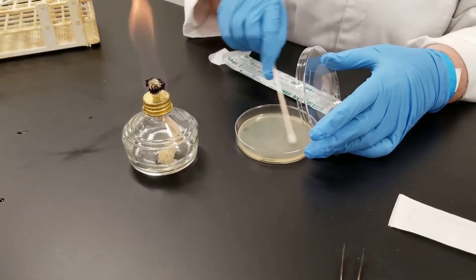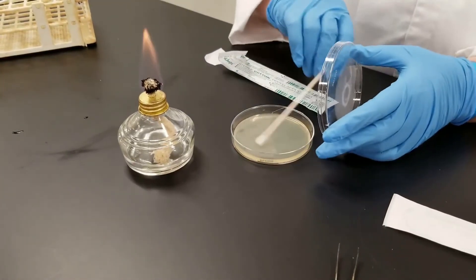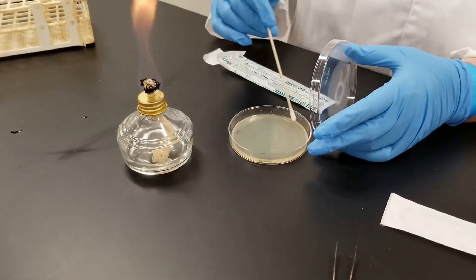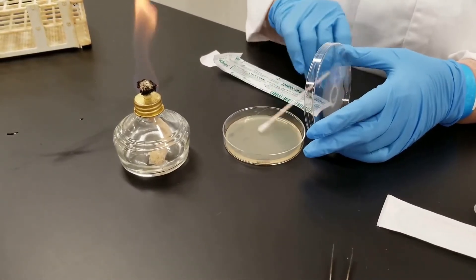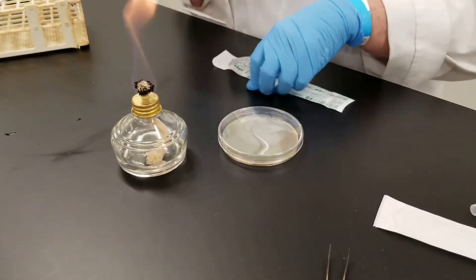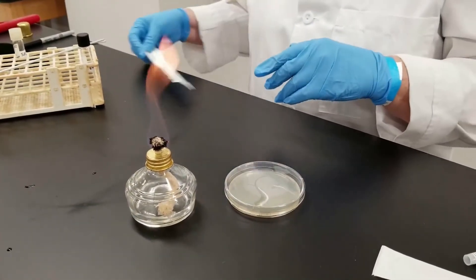First you go in one direction, then you go in another — you just want to have complete coverage across the plate. At the end, you swirl around the plate like this. You don't want isolated colonies; you want what we call a lawn — complete coverage on the plate. When done with this applicator, stick it back into the paper sleeve for disposal into the biohazard container.